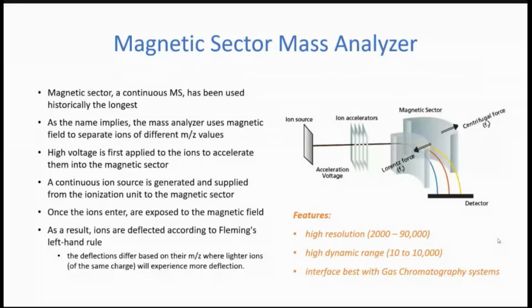And they're huge. I don't know if I show a picture. No, I don't. Just so you know, these instruments tend to take up a lot of space, especially if they're very high resolution. I mean, there are small ones I've seen that are almost the size of a little desktop printer, and they separate carbon and nitrogen. But if you're going to try to separate iron or mercury or high molecular weight atoms, not molecular weight, sorry, high atomic weight masses, then you would want one of the larger systems that can almost be the size of a desk or a room.